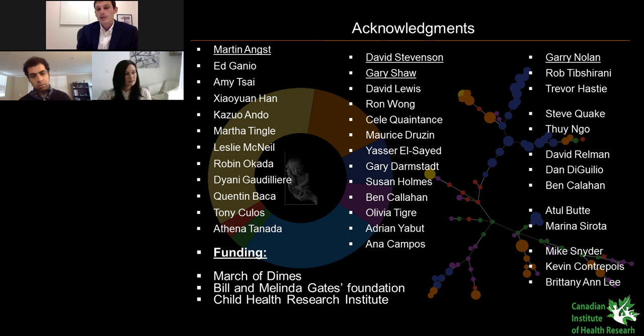If we want to stimulate cells, as we do and as we're doing in Bangladesh, we can use tubes that have lyophilized stimulations. And so it's exactly the same process, whether the cells are stimulated or not. It's not extra burden. And all this is very much standardized.